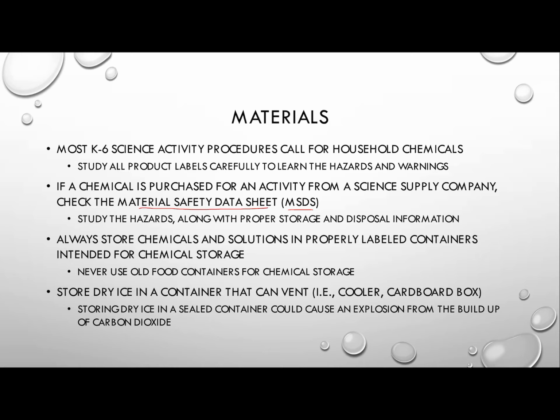So you can still store them in your freezers. They are not going to explode in your freezer because that, believe it or not, is vented. They're just regular old styrofoam ice chest or in a cardboard box, but don't put it in something that cannot ventilate into the room.